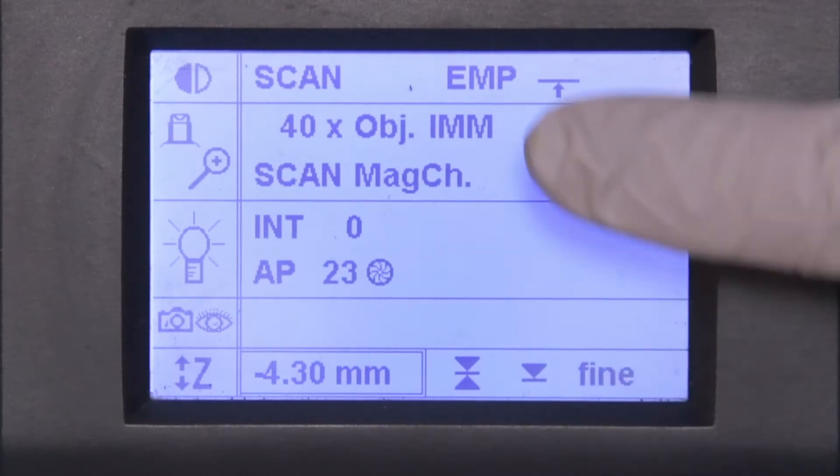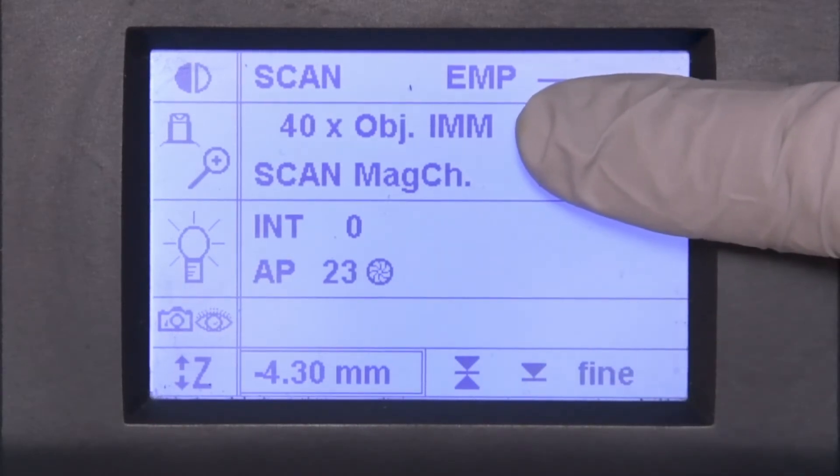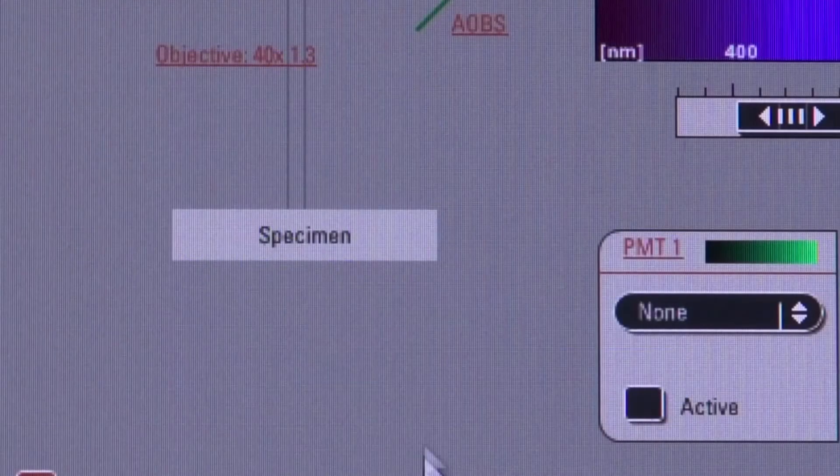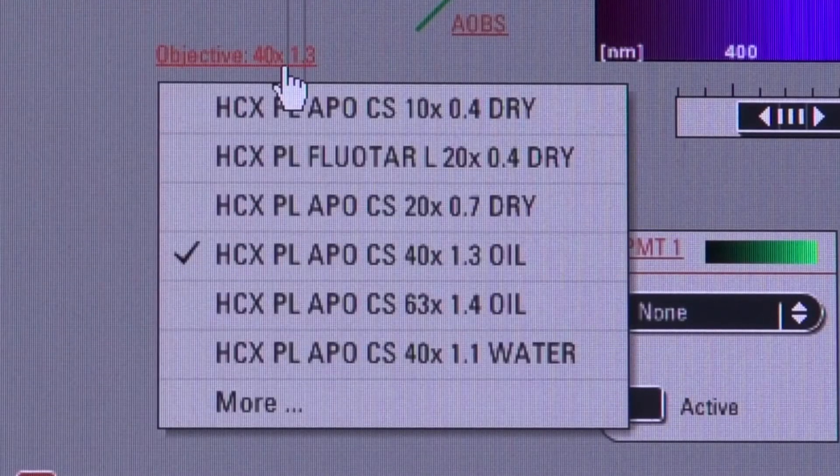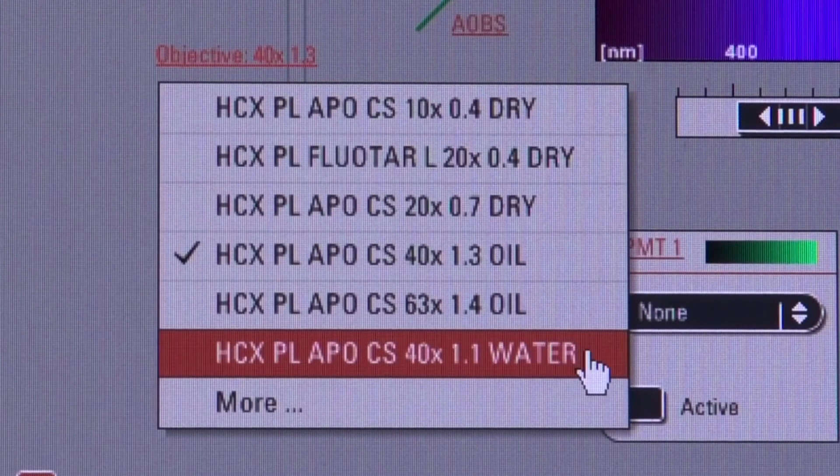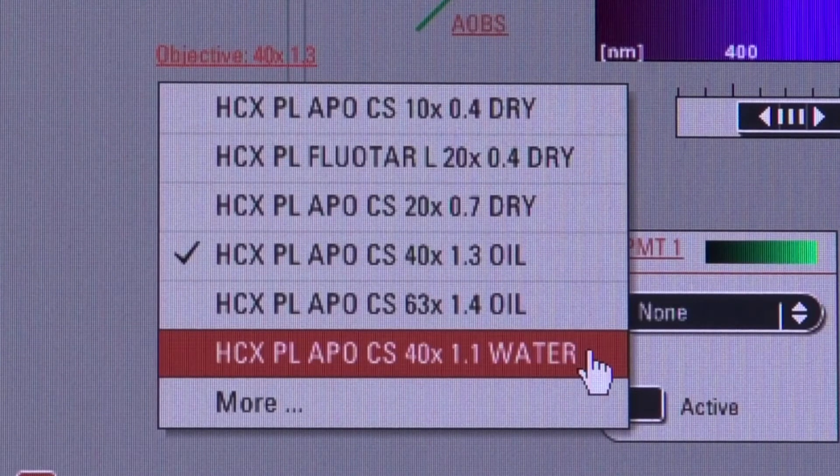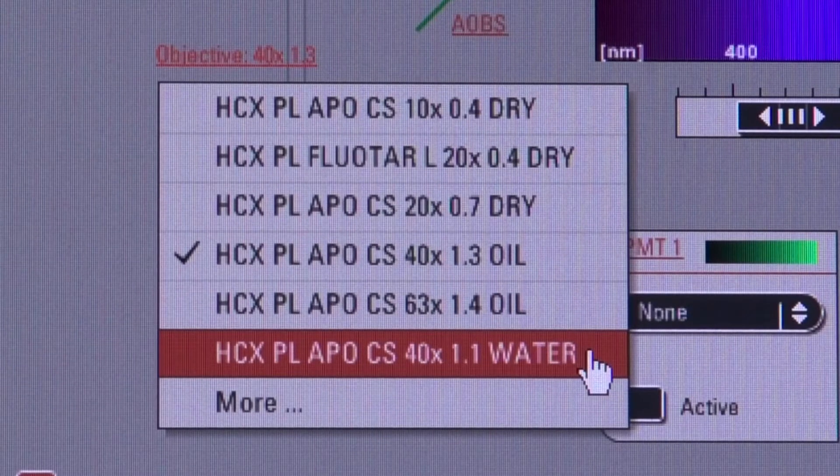Back on the front panel, you can see that it now shows us that this is an immersion lens. Back on our list, notice that we also have a 40X 1.1 NA water objective. This is a special lens that you would rarely use. However, make sure that you do not accidentally select this one and put oil on it. It is not corrected for oil, and your images will look terrible. Plus, we will have to clean off all that oil.